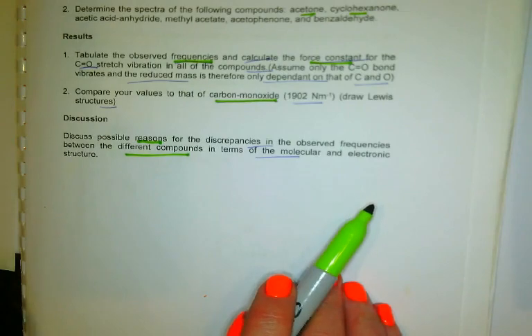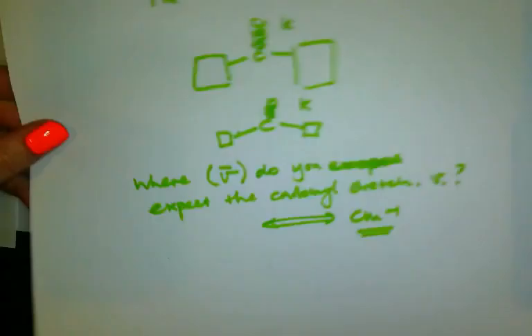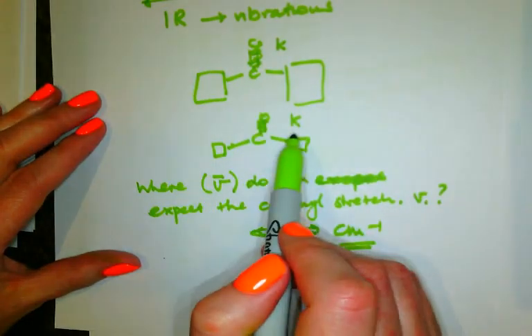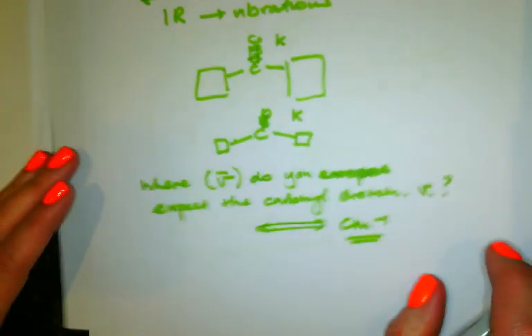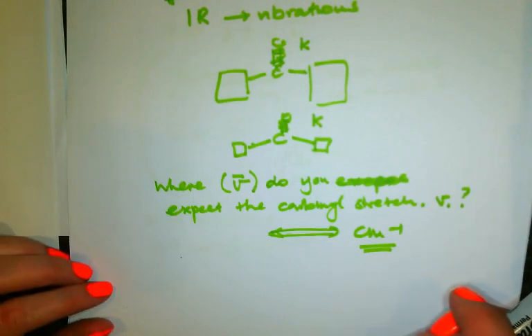So this is where the R groups come into play. Look at the line drawings of the structures and see if you can interpret it in terms of these R groups. Why are some of the springs stiffer than others? Okay, so that is basically a summary of the practical experiment 4.